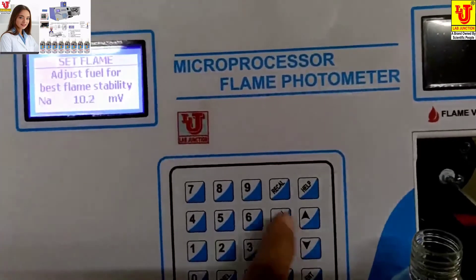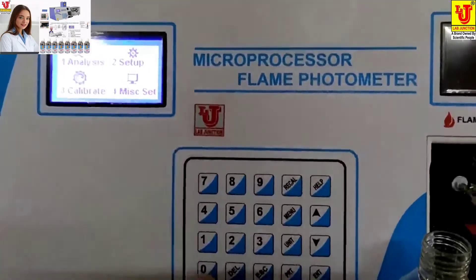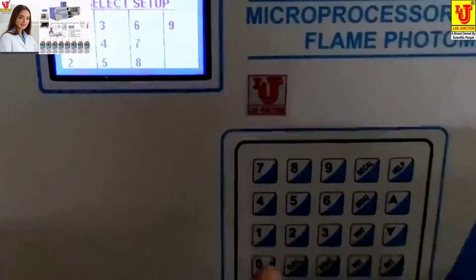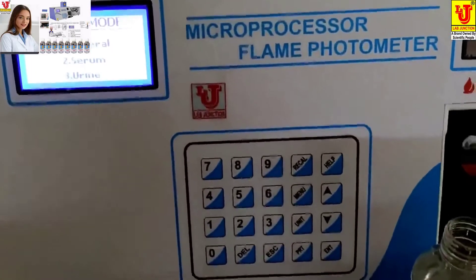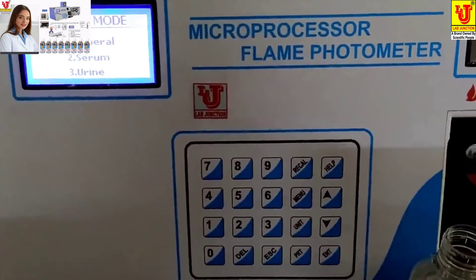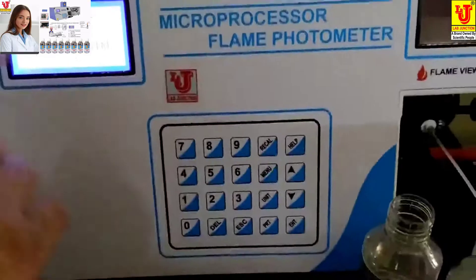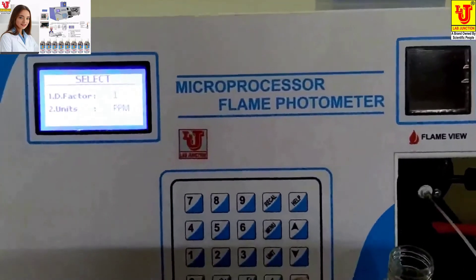Go to the main menu, then go to Setup — key 2. There are 10 setups; I am selecting setup 10. There are 3 modes: general, serum, and urine. Serum and urine are for pathology labs; general is for ppm water testing. Enter the dilution factor — it takes 1. The unit is ppm. Go to proceed.